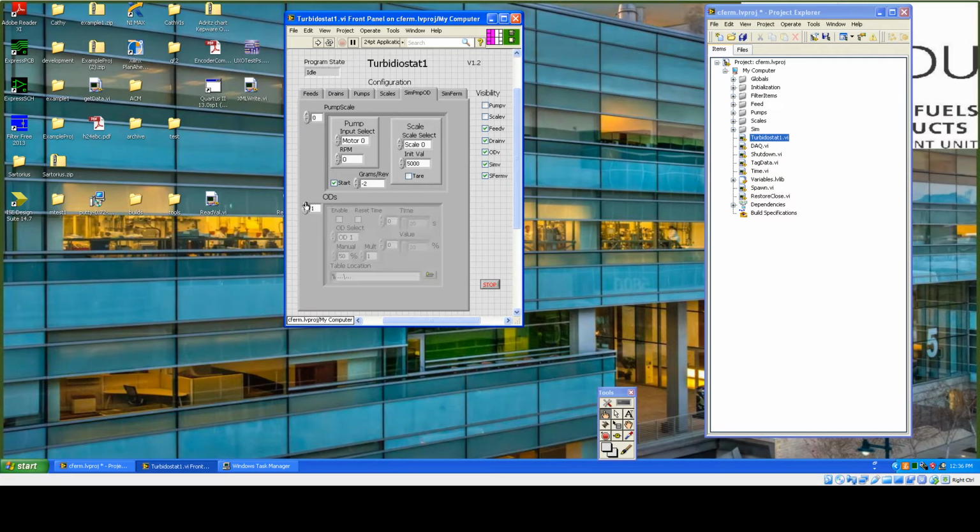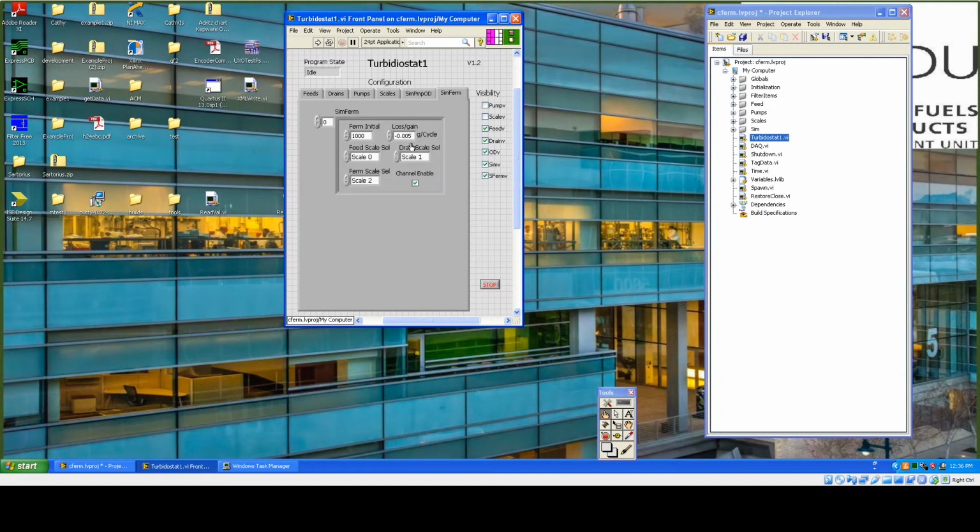We're going to be simulating one OD sensor, and this OD sensor is going to be reading off of a table. Essentially, there's a table location here where we've got a CSV table, essentially a spreadsheet, that has the time value and the OD sensor reading in it.